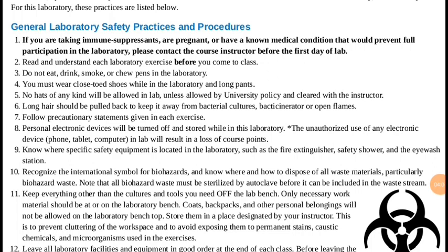We should also know the specific locations of safety equipment. This is because of any accidents, or conditions in the lab that may require these safety equipments. Therefore, it's usually advisable to know the location of this equipment. Equipment that is a must in the laboratories includes fire extinguishers, safety showers, and an eye wash station.